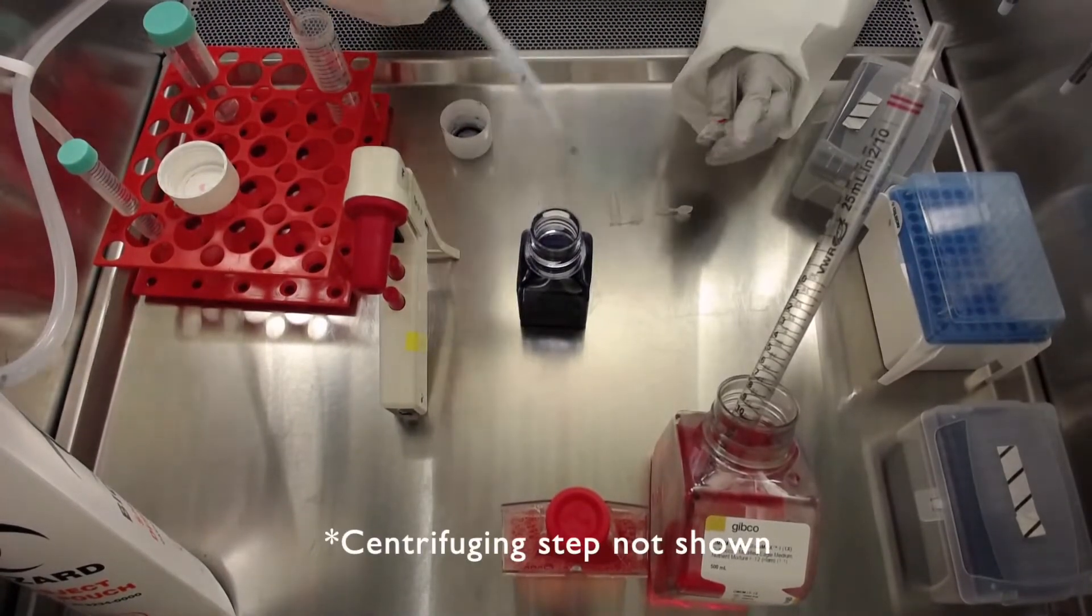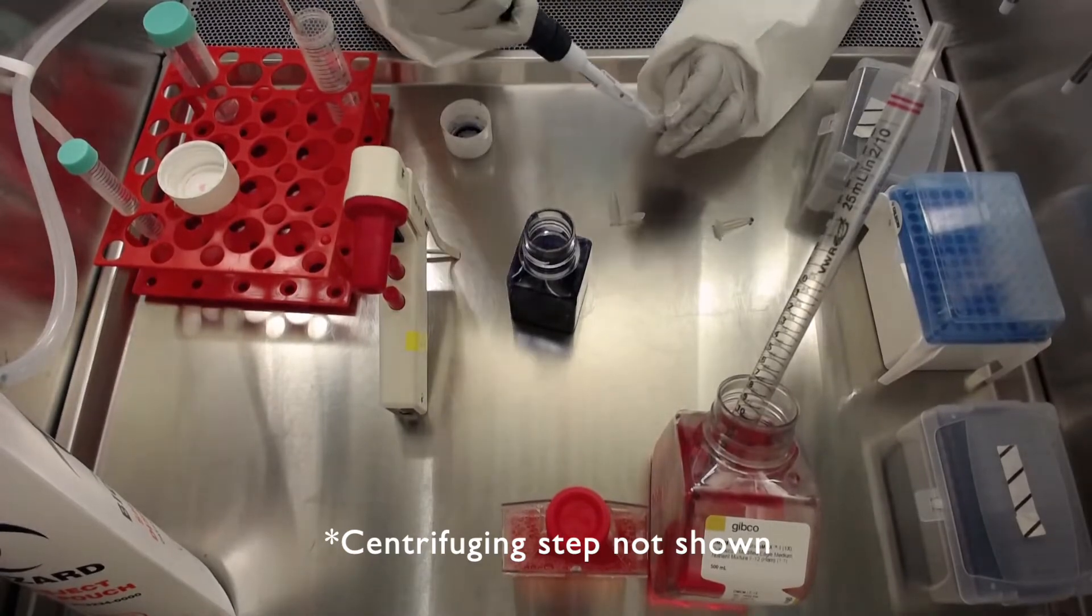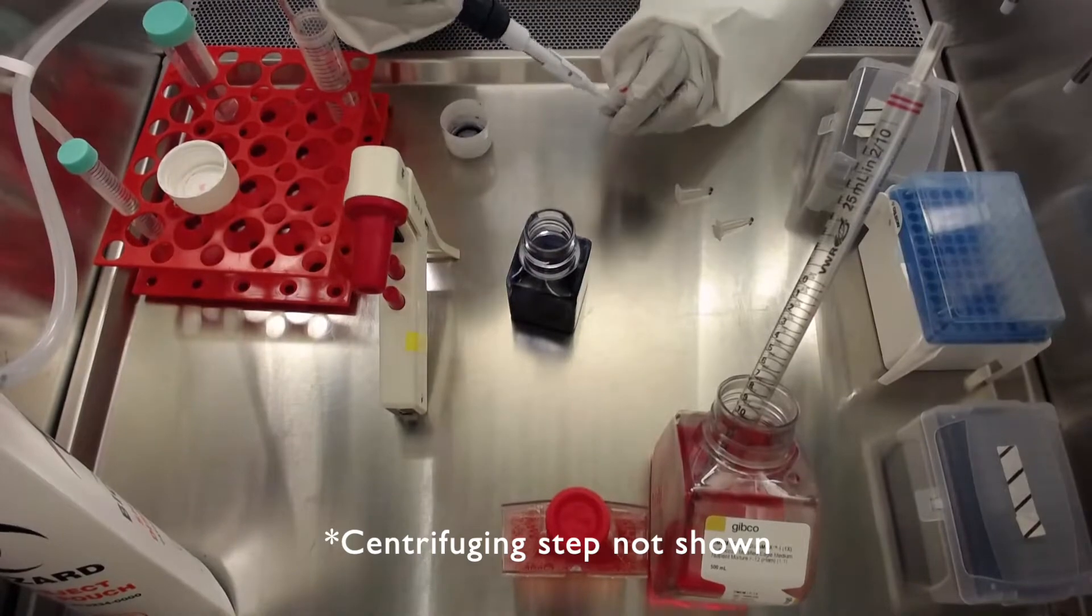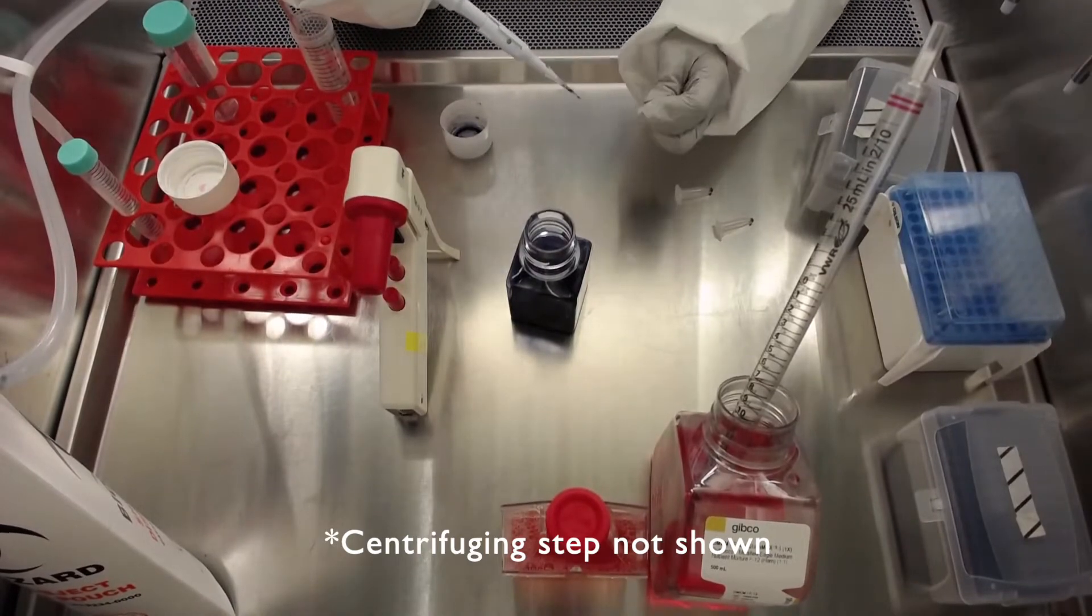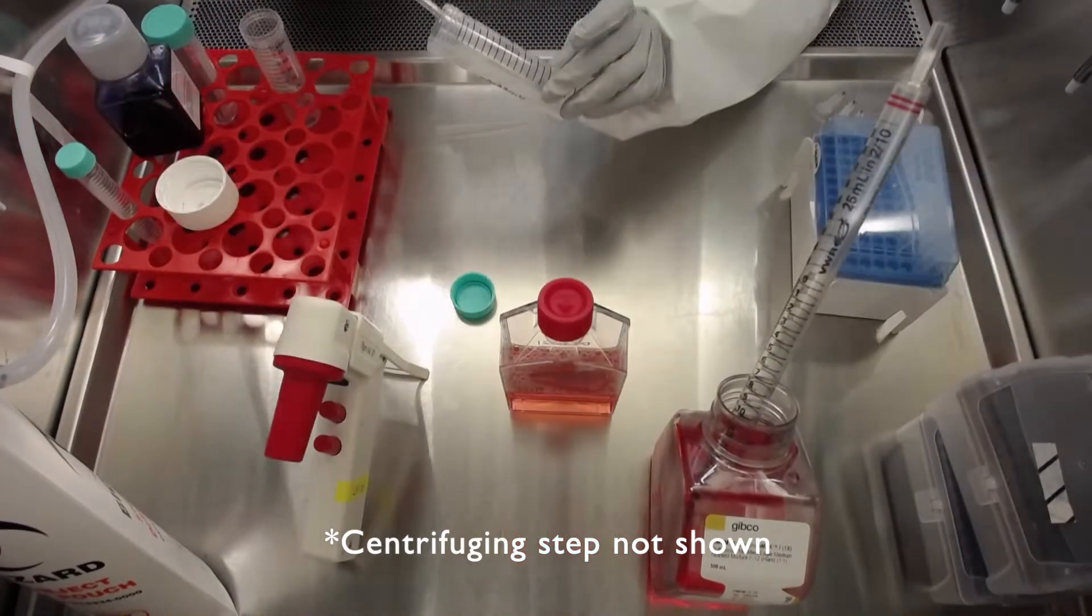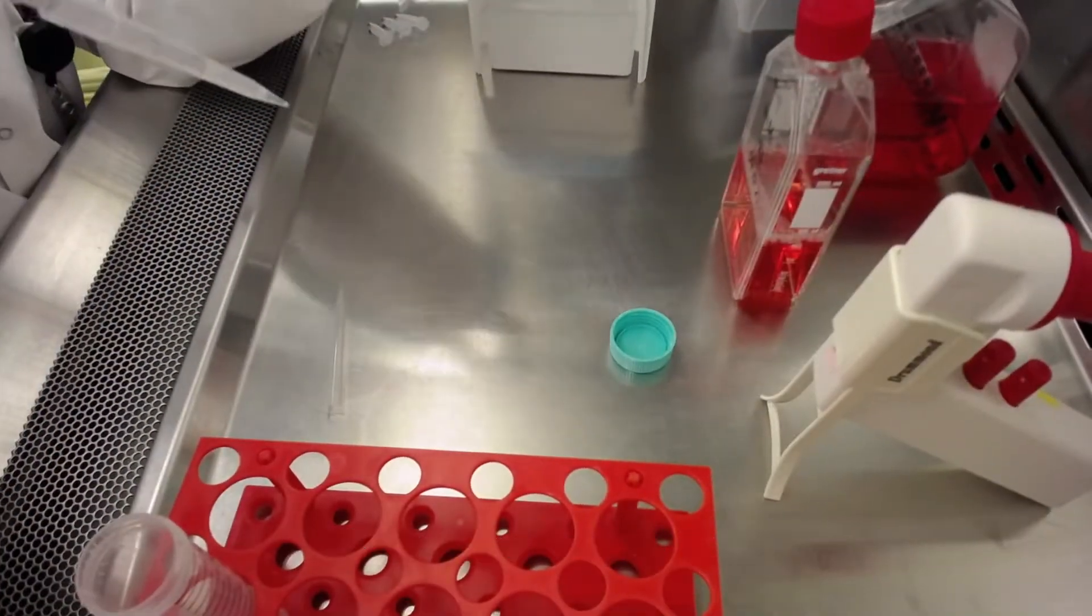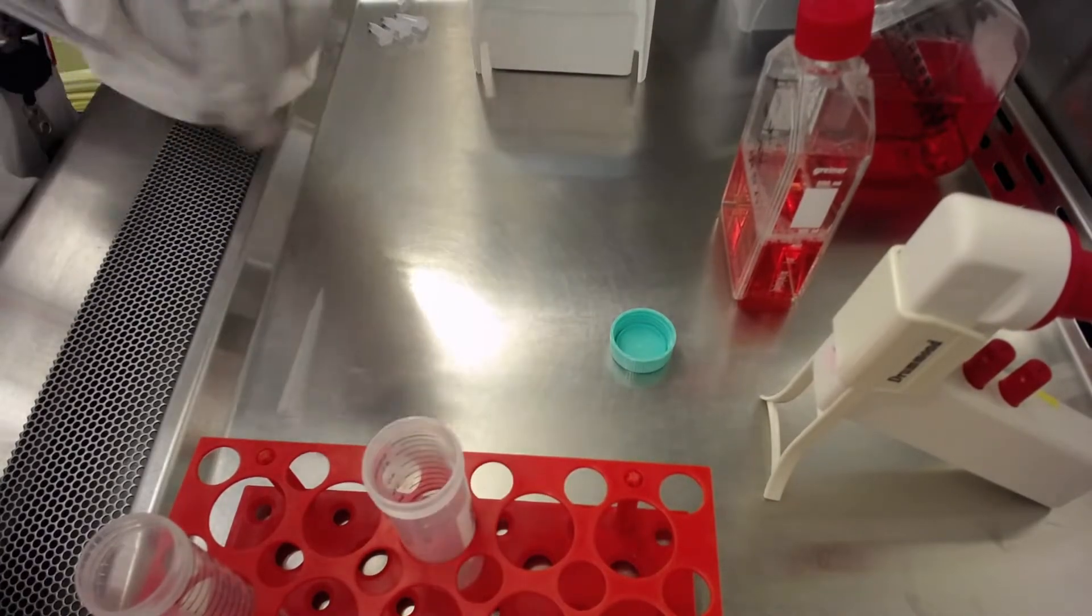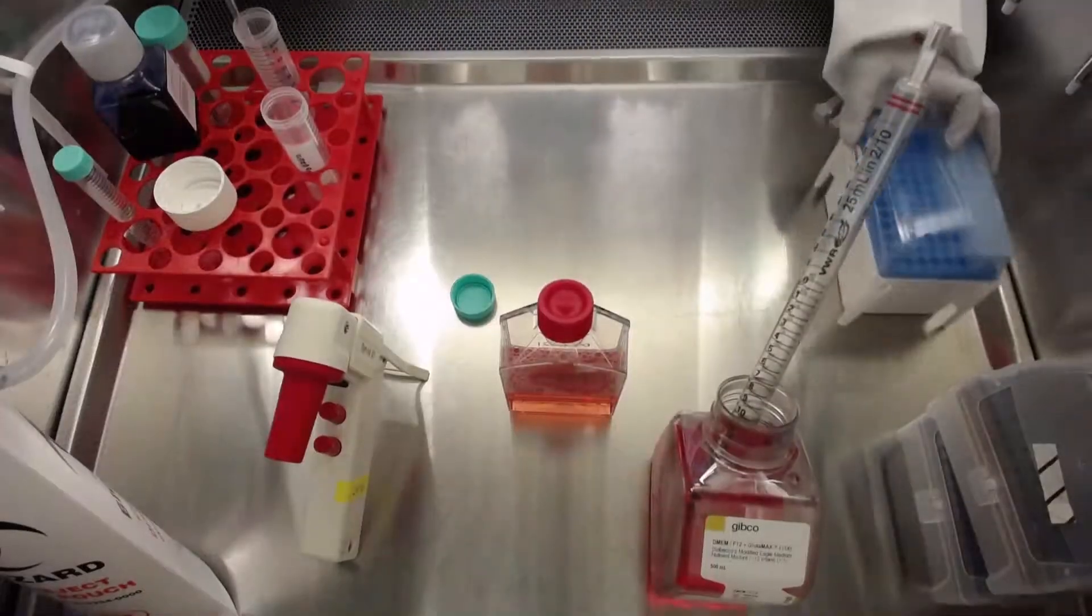Centrifuge this 50 milliliter tube for 3 minutes at 1200 RPM. While the tube is in the centrifuge, prepare for cell counting by aliquoting trypan blue in a sterile 0.2 milliliter Eppendorf tube. After centrifuging, a cell pellet will be formed at the bottom of the tube. Next, remove the supernatant without disturbing the pellet.